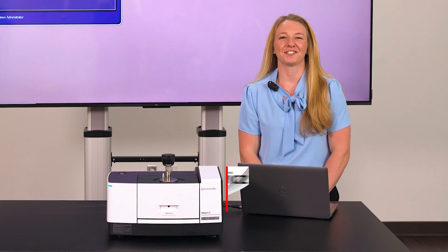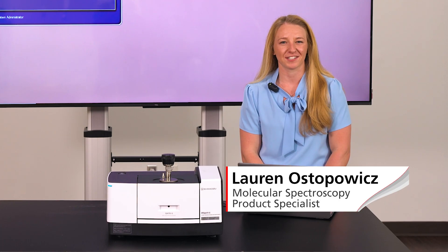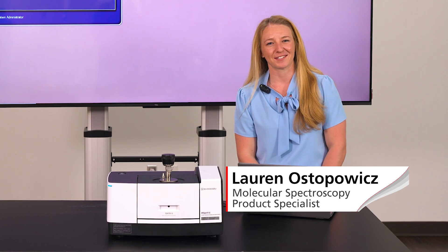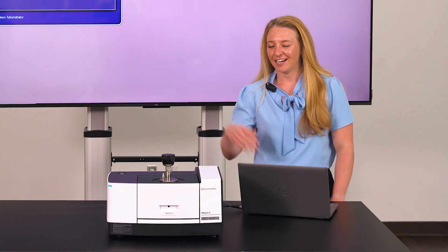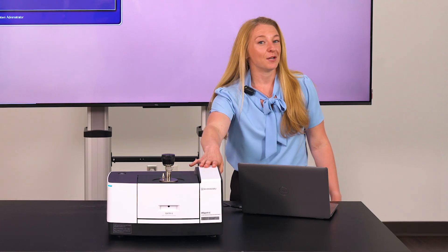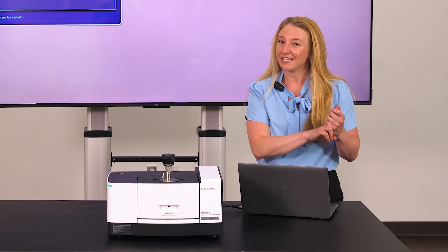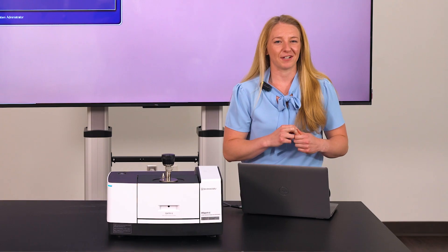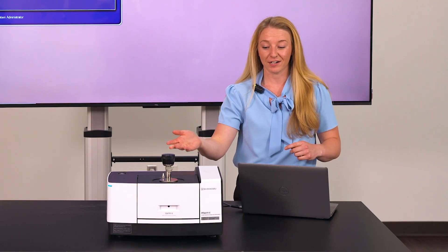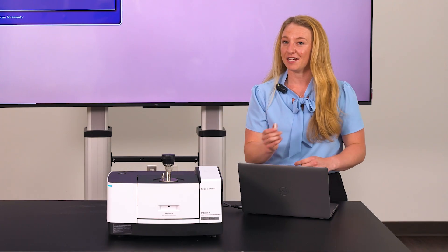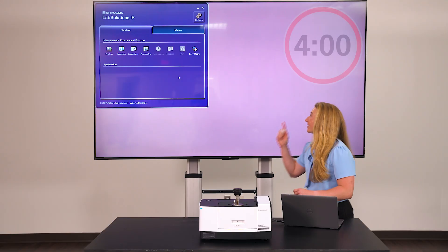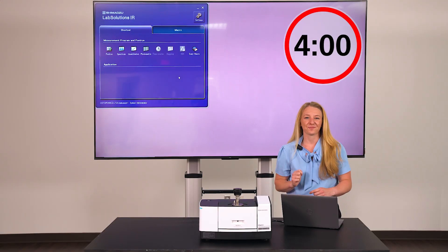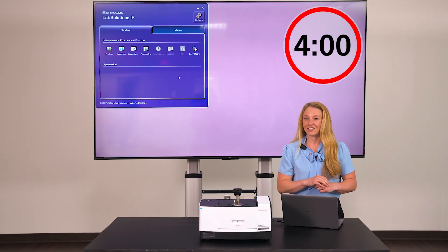Hi, I'm Lauren Ostomovich, the Molecular Spectroscopy Product Specialist here at Shimadzu Scientific Instruments. Thanks for joining me on this FTIR demo video. I'm working with the IR Spirit X, but the process and speed is the same for all Shimadzu FTIRs. From powering on the unit to identifying our unknown sample, can it be done in under four minutes? I have a stopwatch here to prove it. So let's get started.